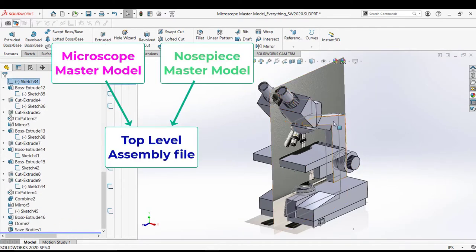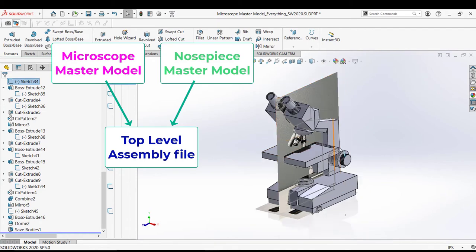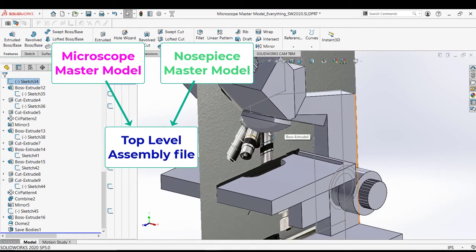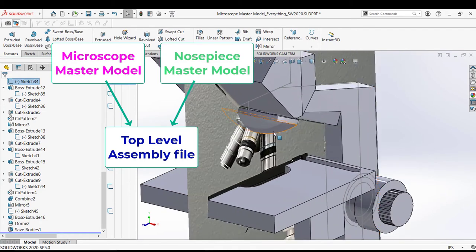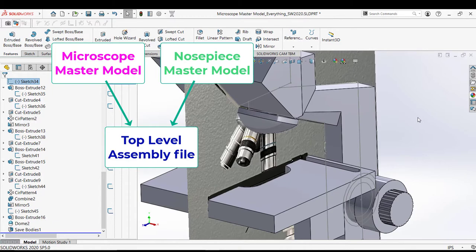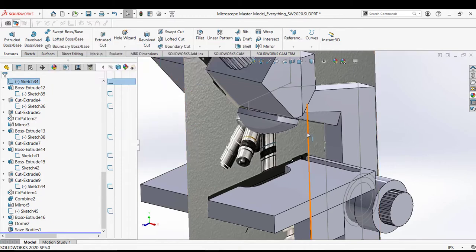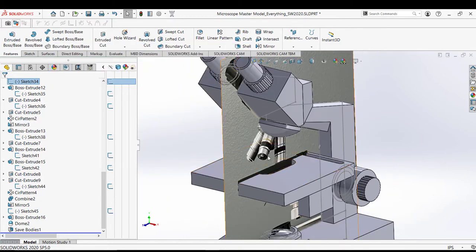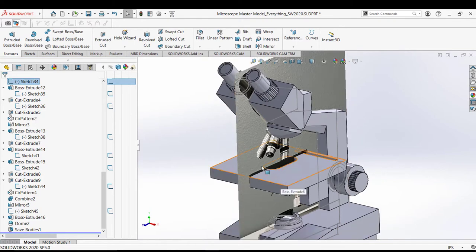This master model, which is basically the body of the microscope. And the master model of the nose piece into an assembly file. Which I will then have movement because it's an assembly. And I can do mates and show the dynamics of how it all works together.